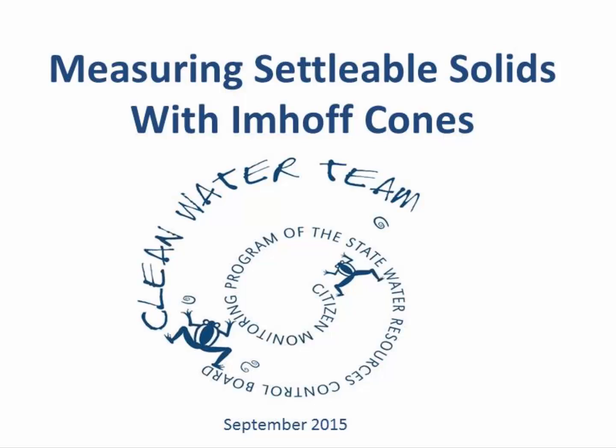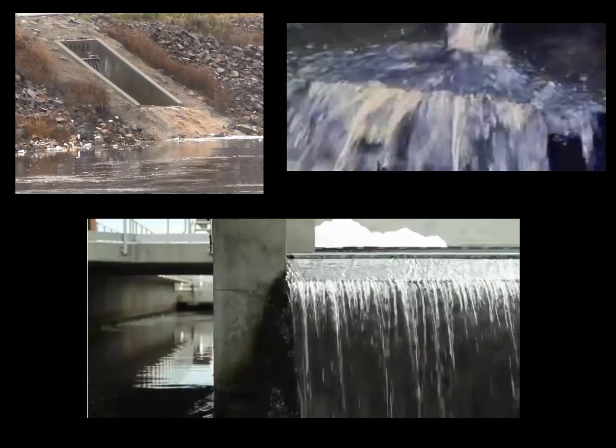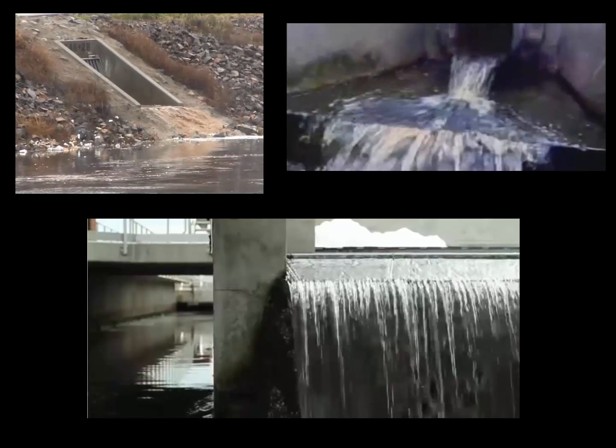In this video we will demonstrate how to measure settlable solids with Imhoff cones. Settlable solids are a common parameter to describe wastewater and stormwater runoff.